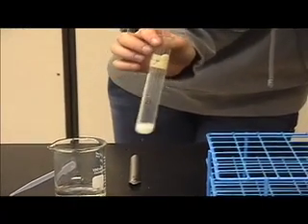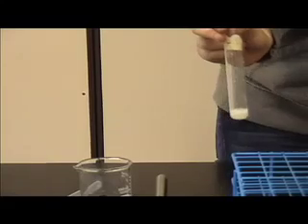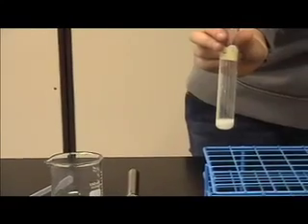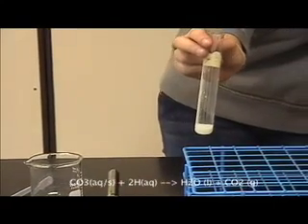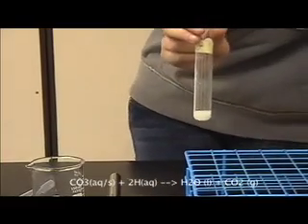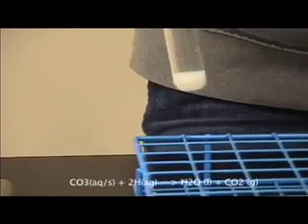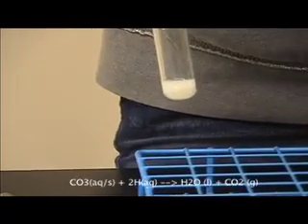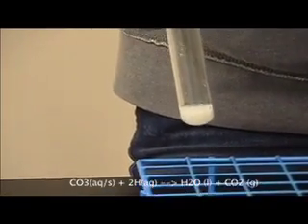So the equation that it's going through is this. So as you can see, we'll have carbonate, which is CO3, and the H+, which will be the acid. And that will yield, on our reactant side, some water and carbon dioxide as a gas, which will be released into the air, which is what causes the fizzing reaction.